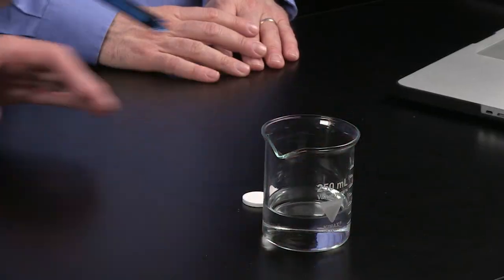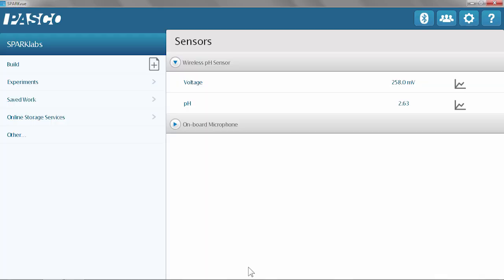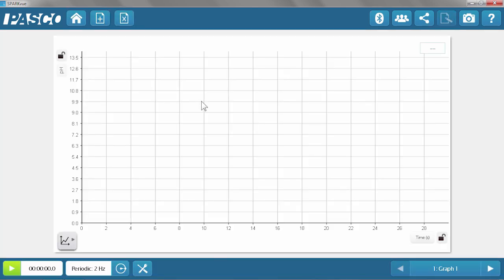Let's take a quick measurement and do a little experiment. I've got some vinegar here. When I place the probe in, I would expect the pH to move towards the acidic level — and it does. It's definitely acidic, down around 2.6 right now, about 3. That's what I would expect for vinegar. On my home screen, I'm going to touch that measurement to create a graph, then touch the green button to go. And there's my pH on a graph.